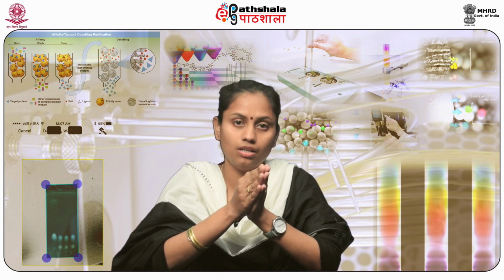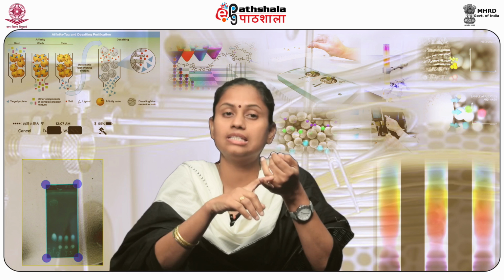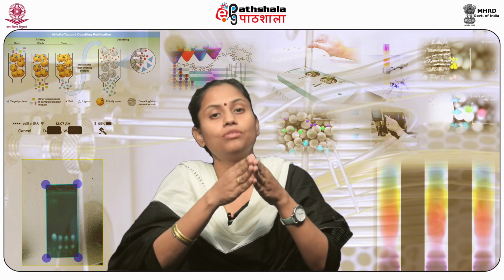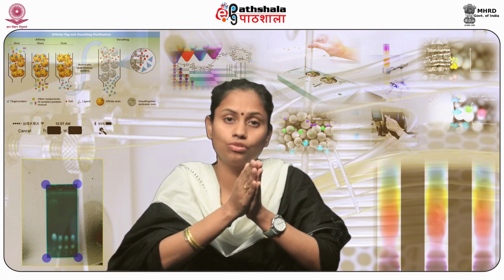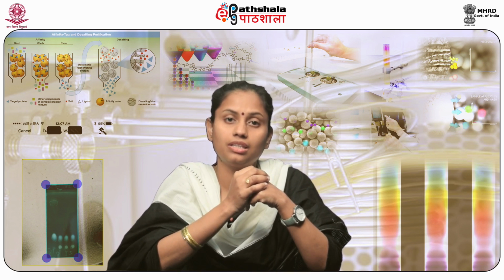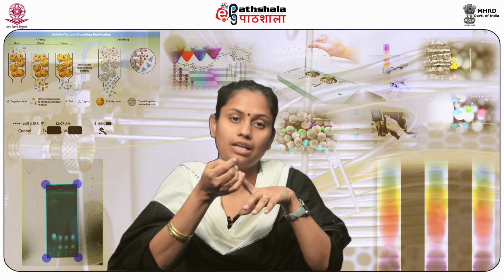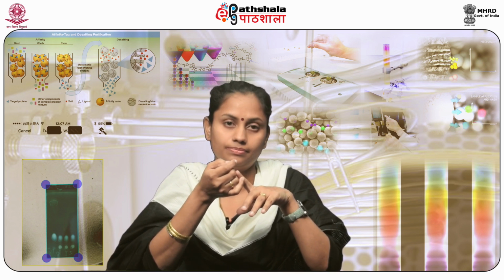The commonly used groups on resins for cationic exchanger are carboxymethyl, known as CM, sulfopropyl, that is SP, and sulfonic group, commonly known as S. The commonly used groups on resins for anionic exchanger are diethylaminoethyl, that is DEAE, and quaternary aminoethyl, that is QAE.